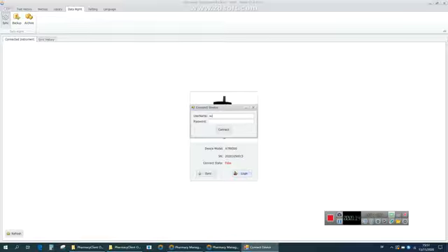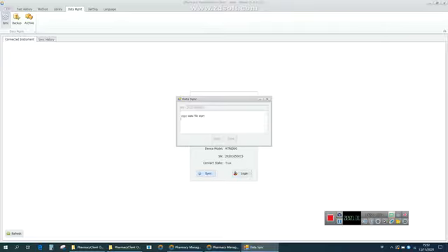And now, the synchronized database is running. Till synchronize complete shows on the computer, you can complete it. Just wait a while. Now it's synchronizing the library.